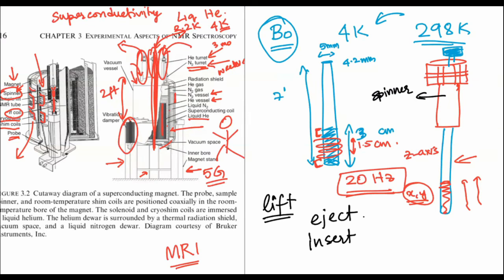So what is the main difference between solid state NMR and solution state NMR? Is it based on the probe that we are using in both? Lot of differences, except for the magnet. Even the magnet, the way the bore is present, wherever the bore is where your probe goes in. Generally, solid state NMR spectrometers have something called a wide bore because their probes are very different in size from solution state. So that is one of the main differences, but there are even more differences that come up.